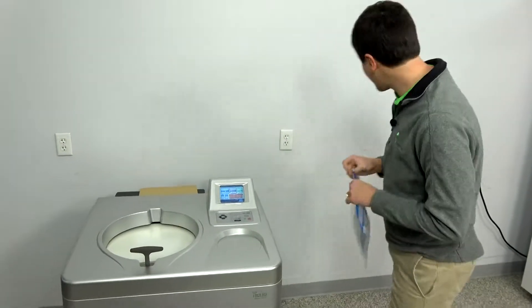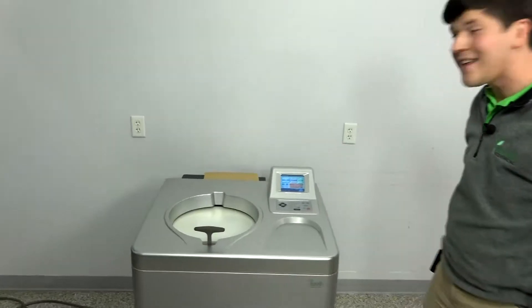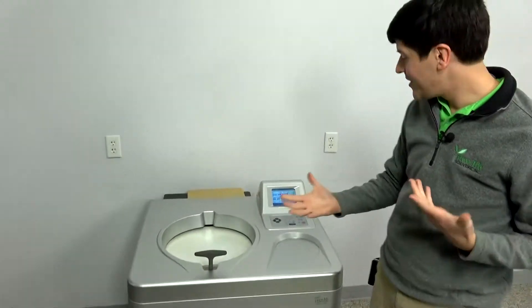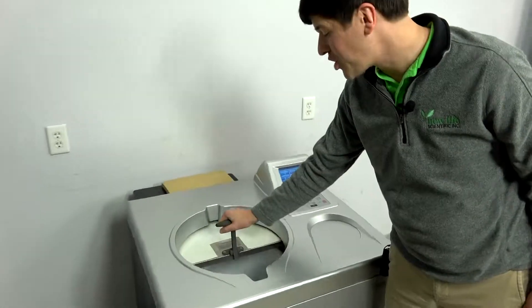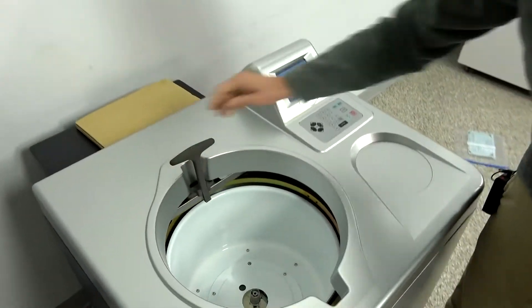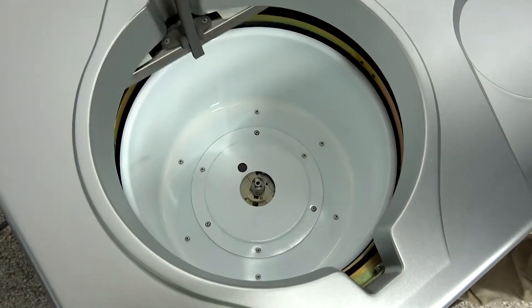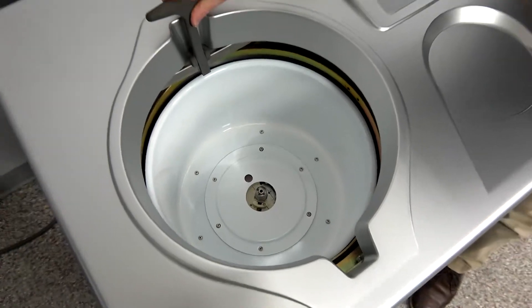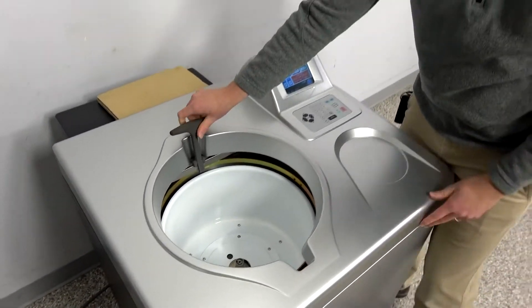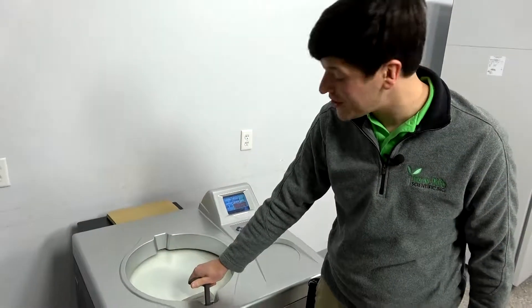When it comes to raw specs, this unsurprisingly does 80,000 RPM — hence WX80. It can do about 602,000 RCF, and it operates at 53 decibels, so it may actually be quieter than your dishwasher. You've got a set temperature range of zero to 40 degrees Celsius.